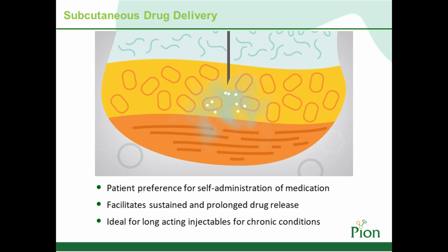Also, there's been an increase in insoluble and long-acting drugs on the market, which are ideal for subcutaneous drug delivery due to the nature of the subcutaneous space, which aids in the slow delivery of drugs over time, allowing for a more sustained release of that drug.